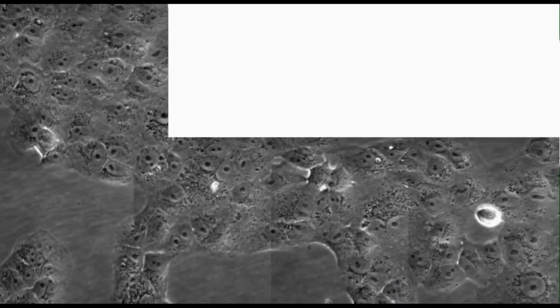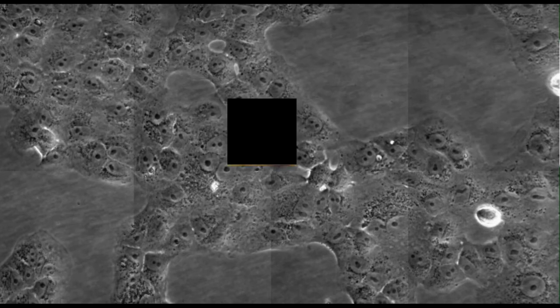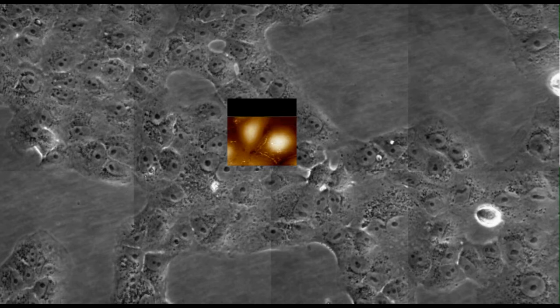All individual maps can be analysed using the batch processing option, and environmental control accessories ensure that cells and tissues can be kept under physiological conditions.